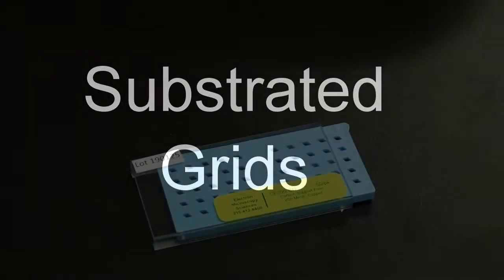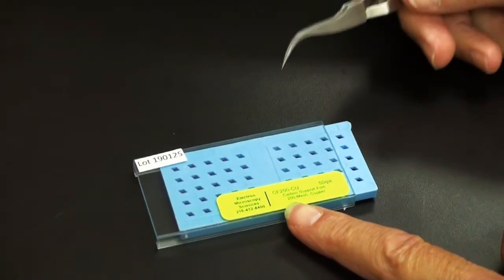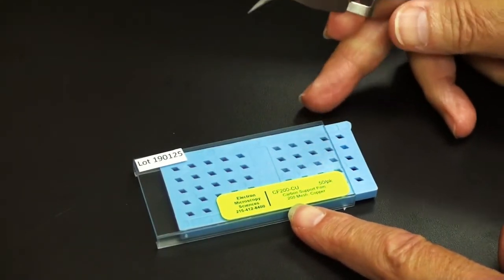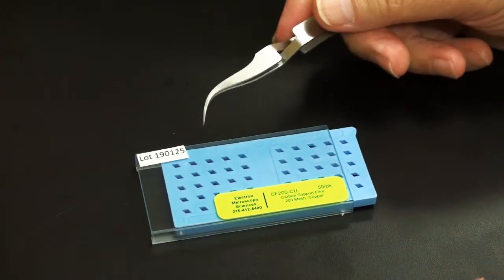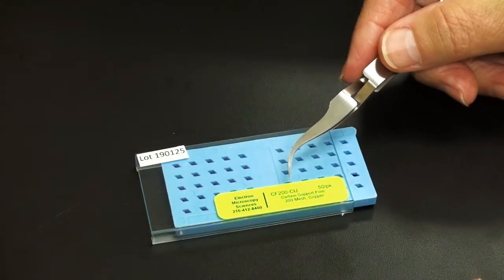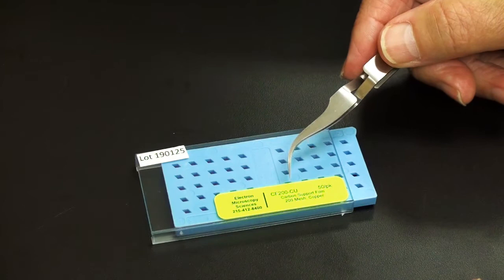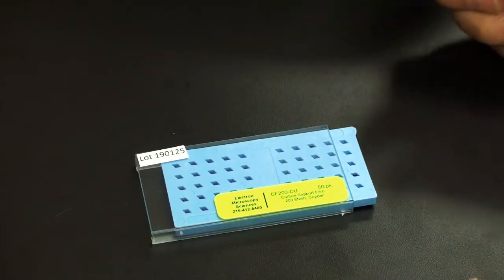This video covers the use of substrated grids for TEM. I'm using 200 mesh copper grids. They come in nickel and gold and meshes from 150 to 1500, but I'm going to be using these 200 mesh grids.